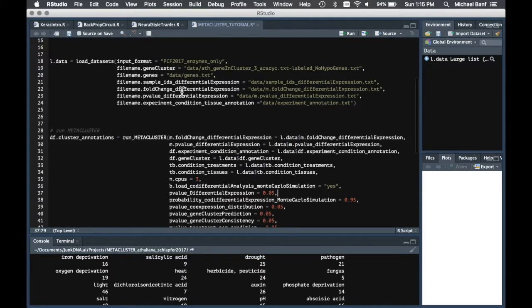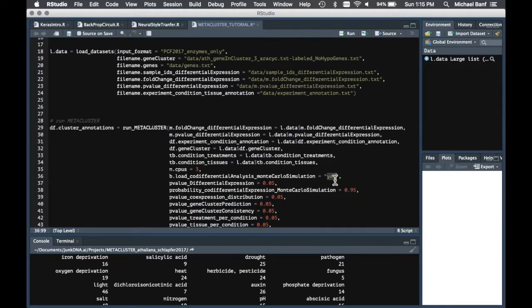So in our case here, we set this to yes, because we have been pre-processing these matrices, and you've just downloaded them along with the other data sets. They're stored in the temp folder, and since we're working with the same differential expression data, we can just load these matrices.